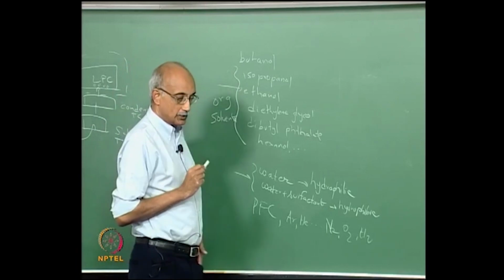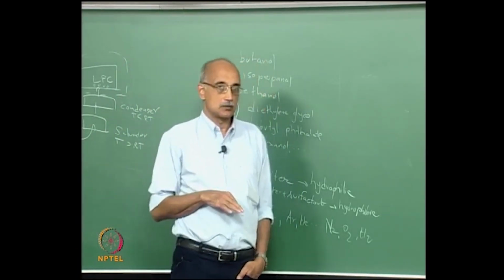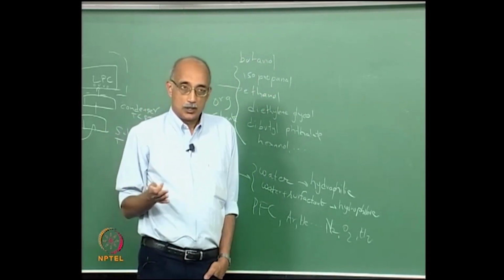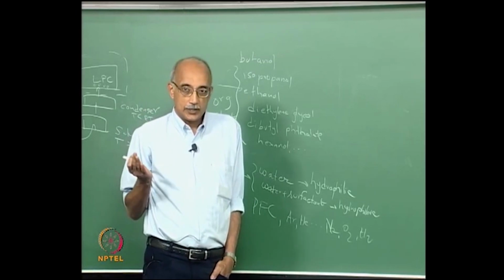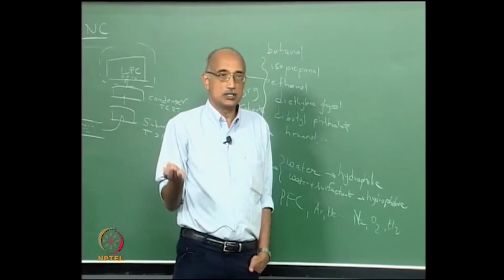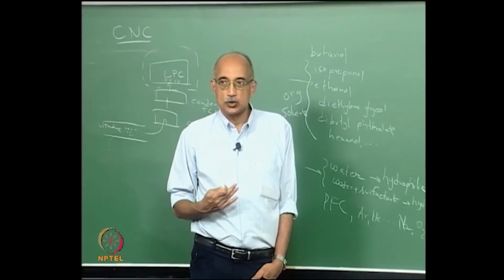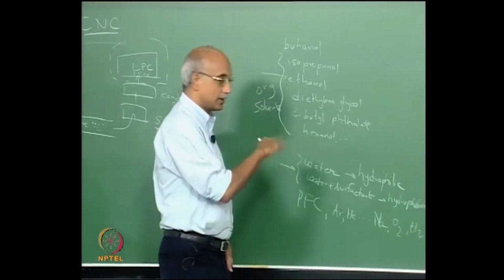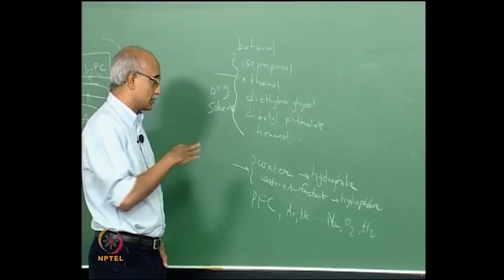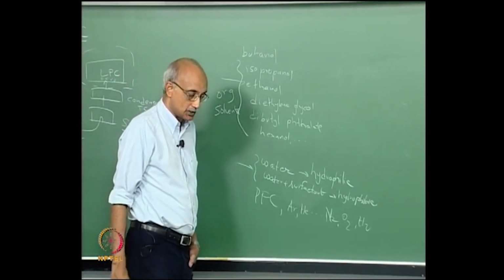The only problem with ethanol is it has beautiful properties. It has very high condensation potential and high evaporation potential. There are no toxic effects. The only difficulty with ethanol is sometimes procurement. Methanol is much easier to obtain compared to ethanol, so prices are higher, availability is lower, but you only require really small quantities to do this test. So it's not such a big issue as far as doing this testing is concerned.